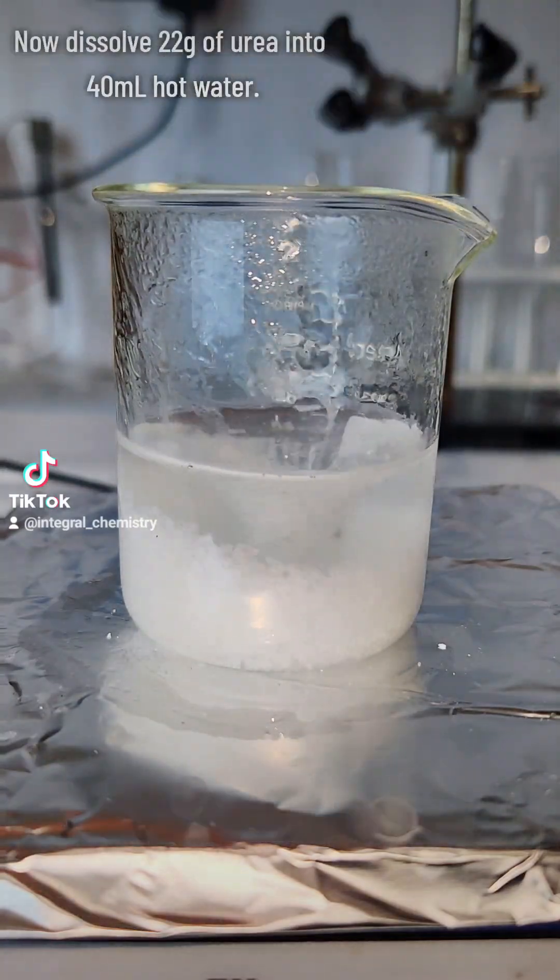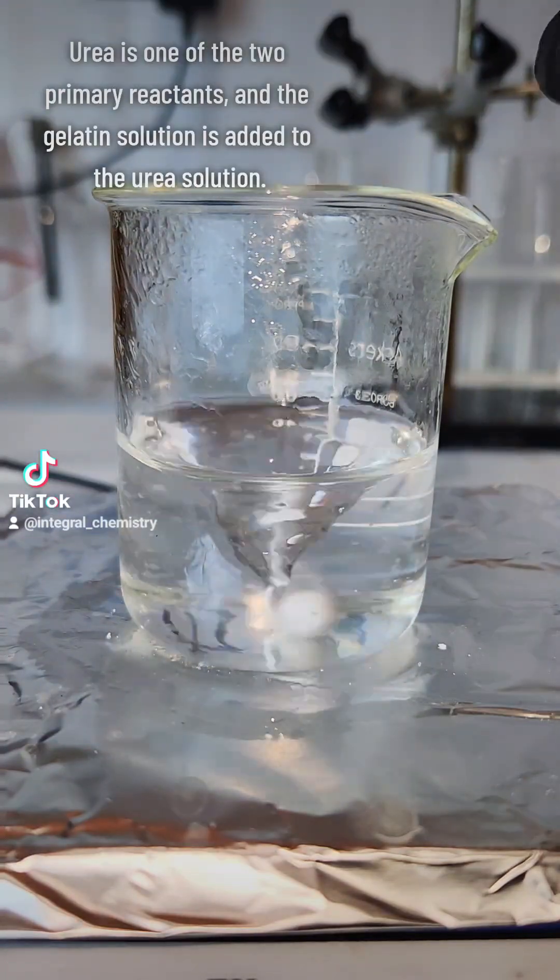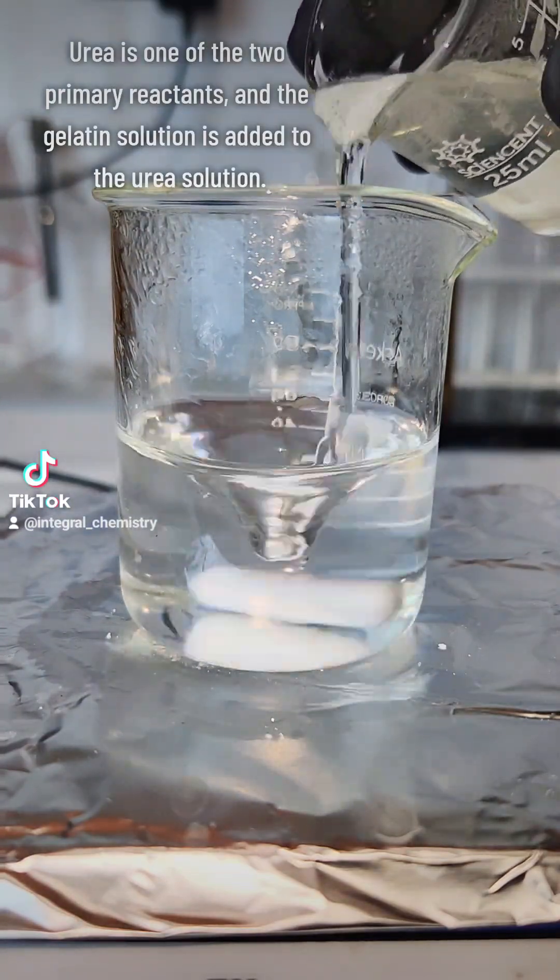Once the gelatin is done dissolving, I then dissolve 22 grams of urea in another 40 milliliters of hot distilled water. These two are then mixed together thoroughly, and this step is done.